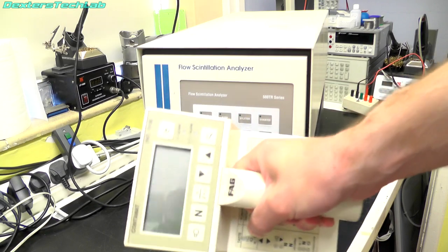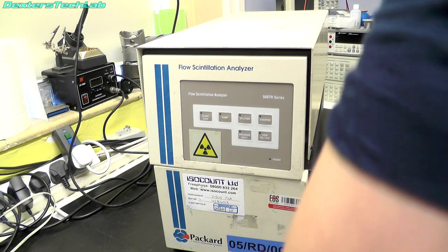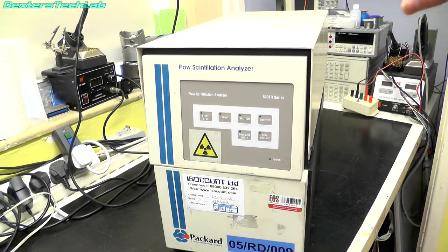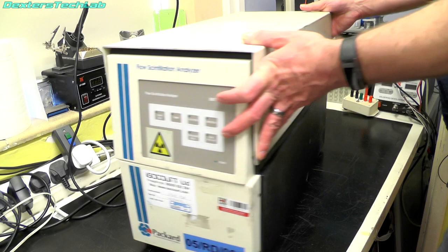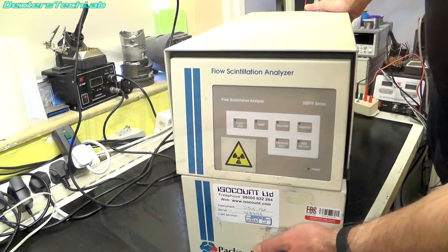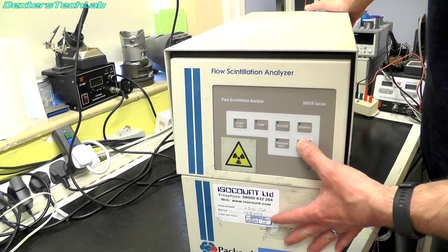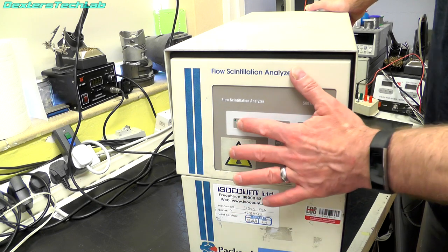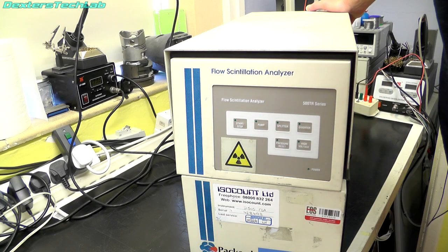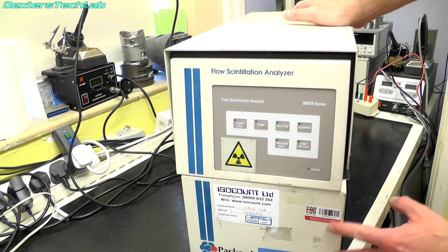Before anybody asks, I have been over this quite thoroughly with my radiation contamination meter — there is no residual radiation in this at all beyond background. So it's a big massive box, all metal construction, with a few controls on the front, some little LED indicators, and what are basically horrible membrane keypad push buttons. There are lots of stickers on the front as well.